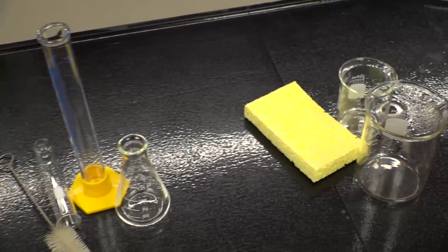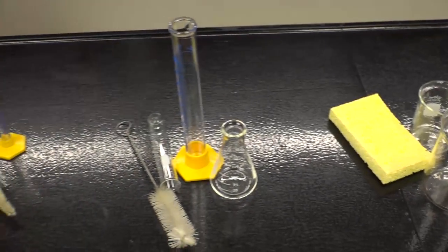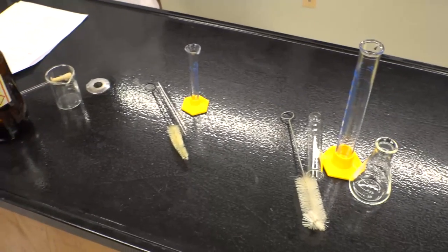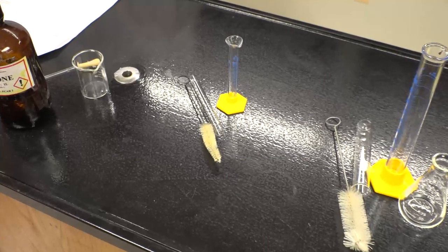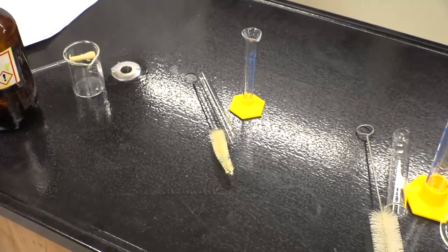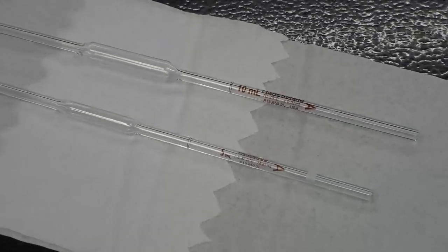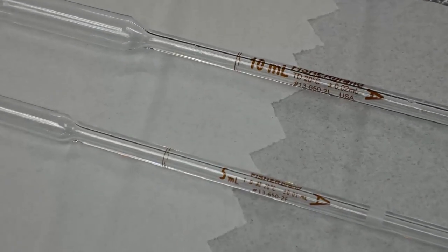For pieces such as flasks, test tubes, and graduated cylinders, you will use the same method used to clean the beaker, except you will not be scrubbing with a sponge. Instead, you will use an appropriately sized test tube brush found in your common locker. For pieces such as your burette and pipette, it is either not recommended or not possible to scrub the glassware.